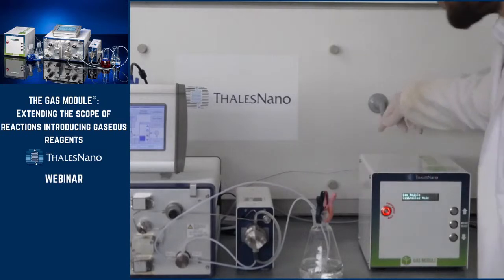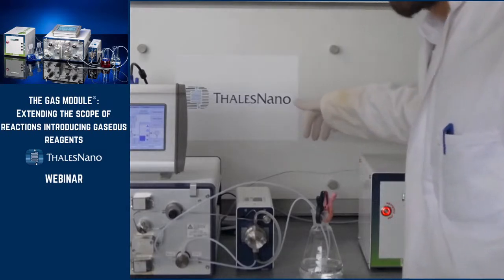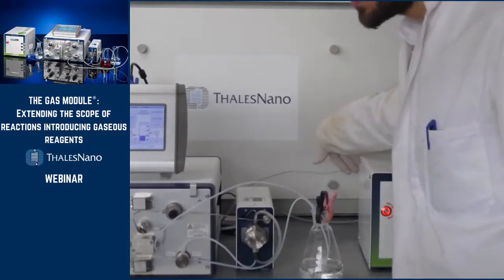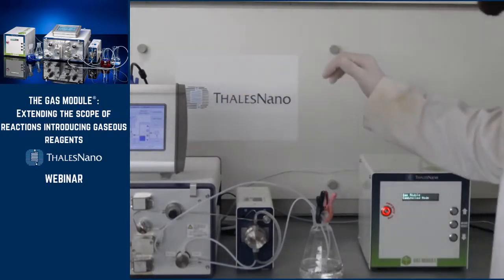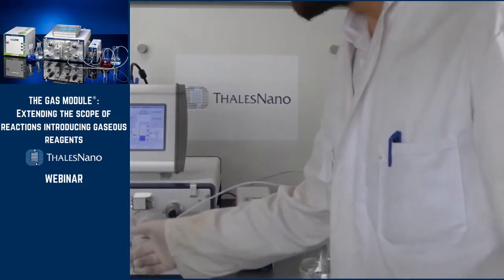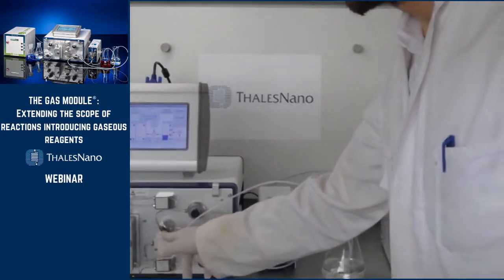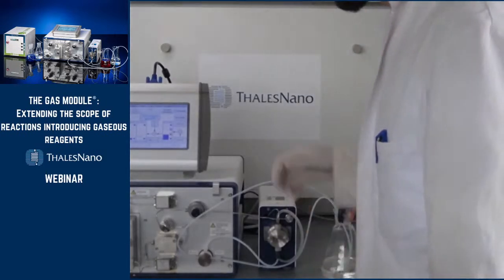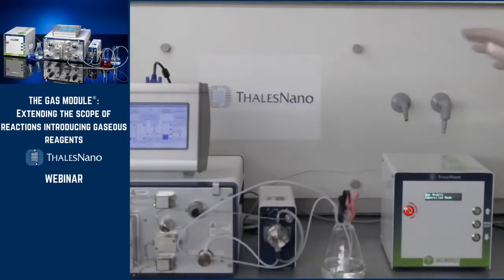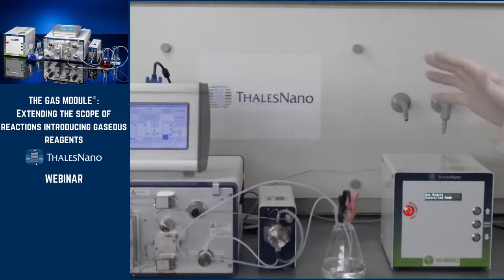And then it comes out from the back of the gas module, and maybe you cannot really see it here, but this stainless tubing in which the gas is going goes to the back of the H-Cube Pro, and then it's going to be mixed with your liquid, as I said, at the gas-liquid mixer on the H-Cube Pro. So it's either the use of the hydrogen produced inside or another gas. So if you connect the gas module, then it disables the production of the hydrogen inside.